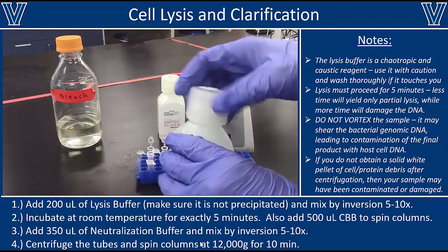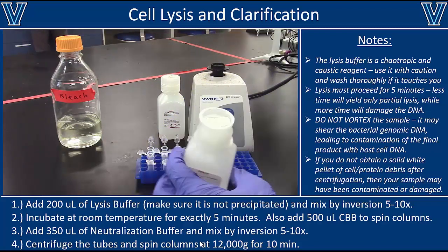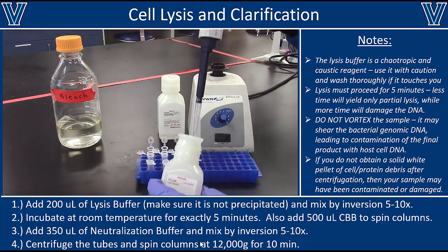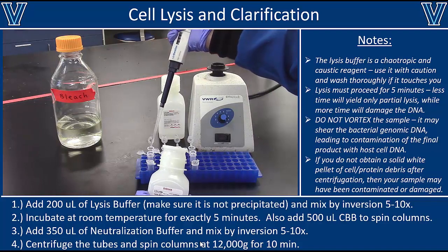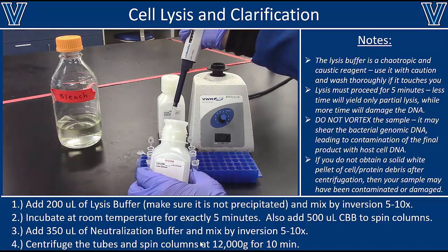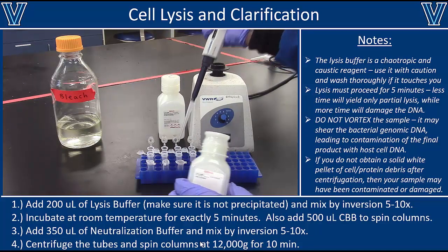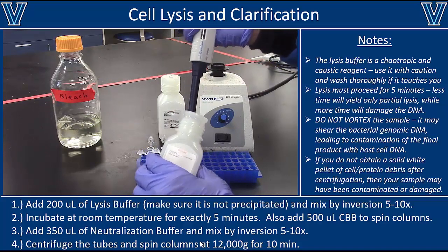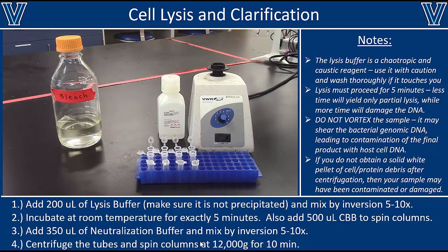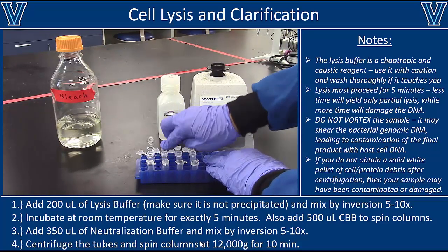Next, what we're going to do is add the lysis solution to each one of these samples. So again, check to make sure there's no SDS precipitate. If there is, warm up the solution until it dissolves. But here it's clear, so we're going to add 200 microliters of lysis buffer to each one of those samples. Now, if you are working with a larger volume or a larger cell culture, you could double these steps, so add double the amount of resuspension buffer, lysis buffer, and neutralization buffer, but 200 microliters is a good starting point for most cultures.